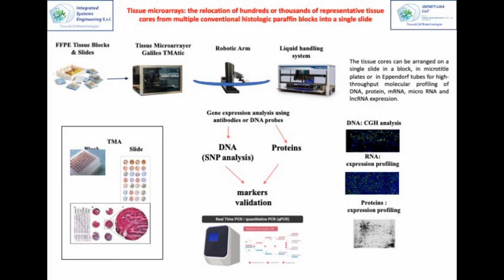As you can see, the Galileo TMAtic platform allows to make a TMA block, giving the opportunity to analyze hundreds of tissue cores simultaneously under the same conditions and make a molecular and genetic analysis of each extracted tissue core from the same block and near the tissue core placed into the TMA block.